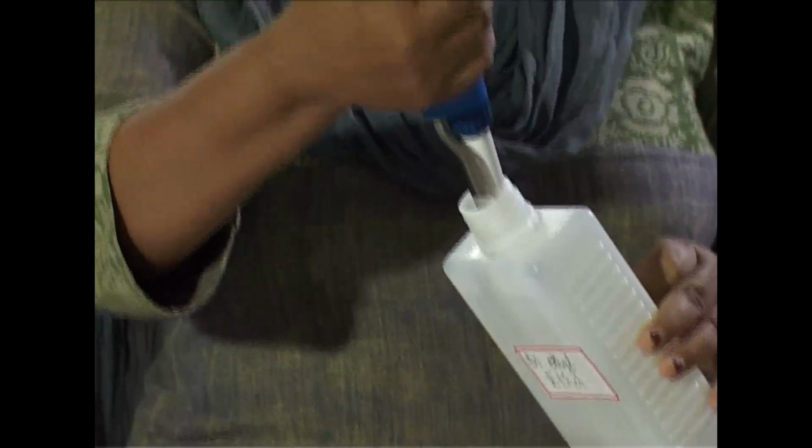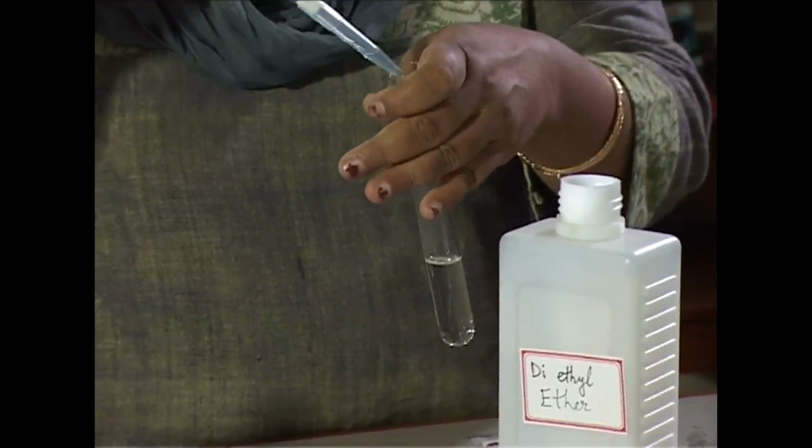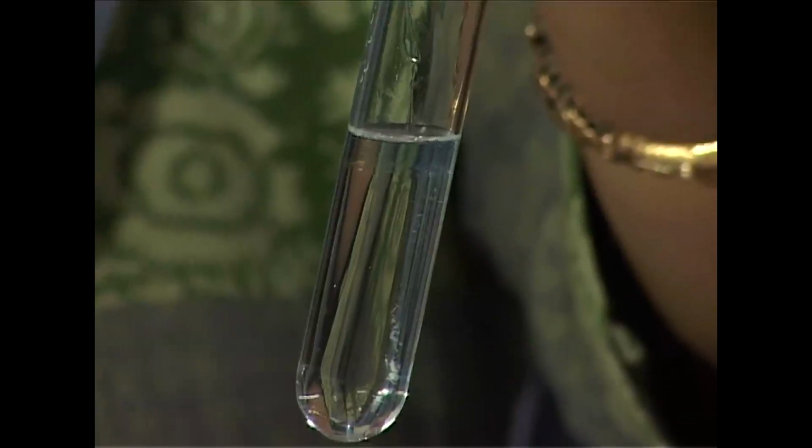3 ml of the liquid culture is taken. We are adding first 1 ml of diethyl ether. So we will wait for some time so the ether level will rise at the top. So it will make the organic layer. After that, we have to add the Kovac's reagent.